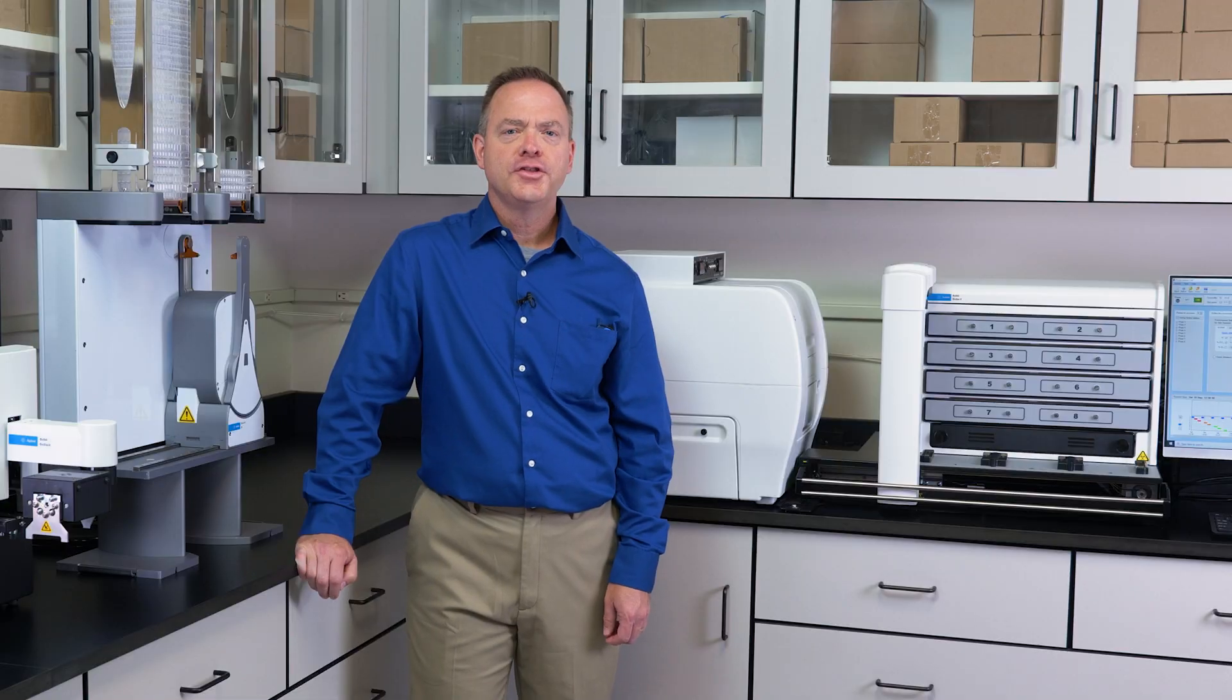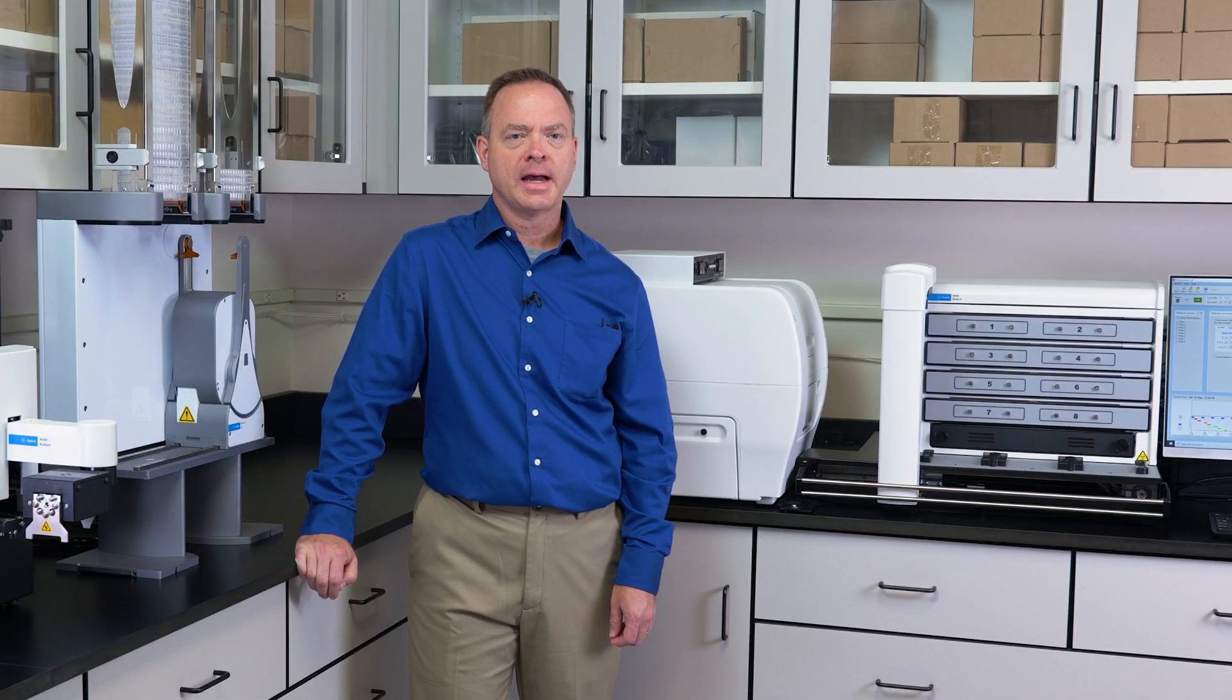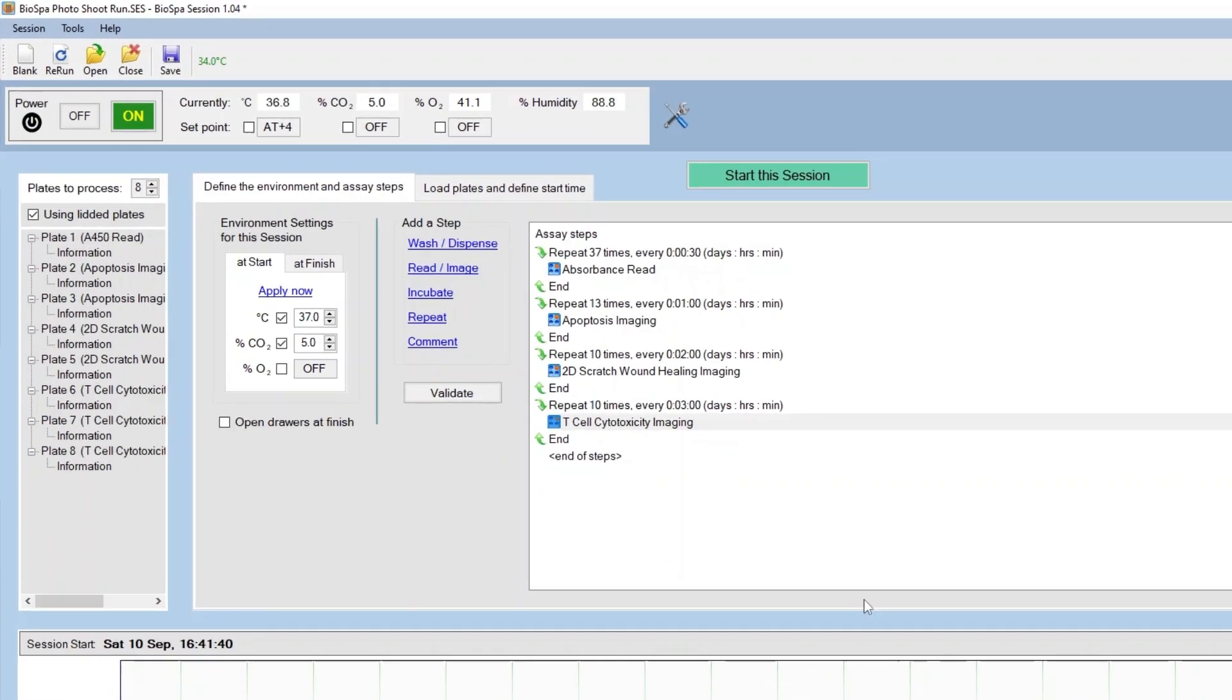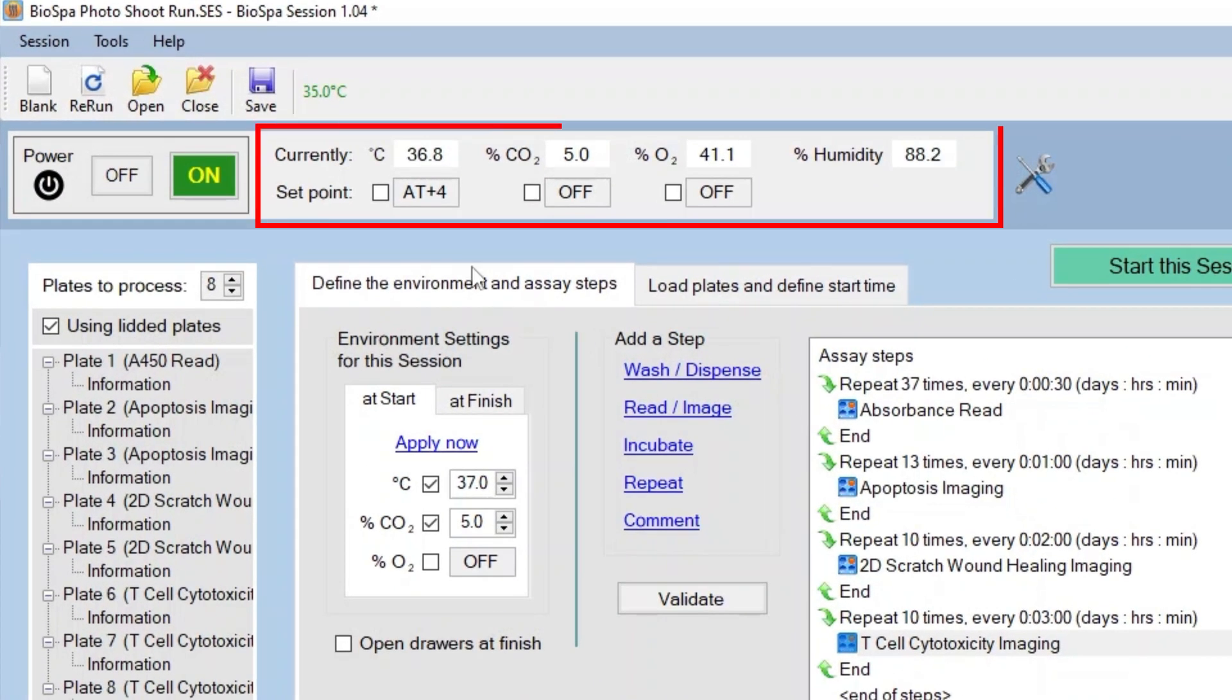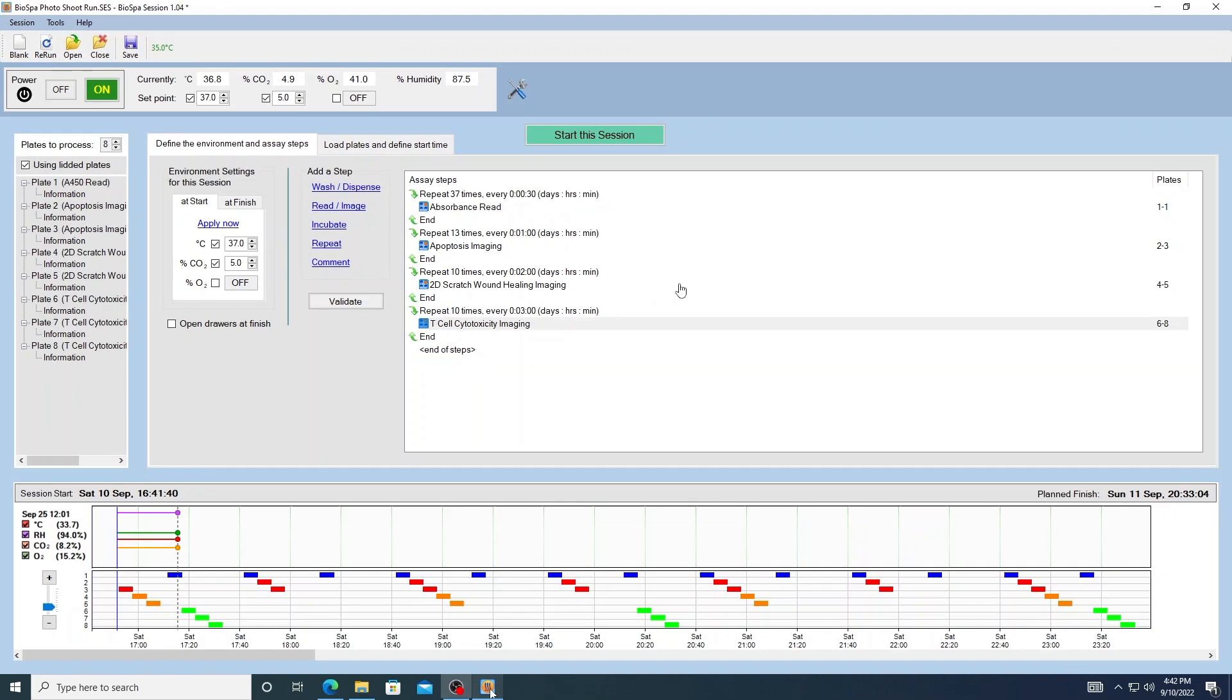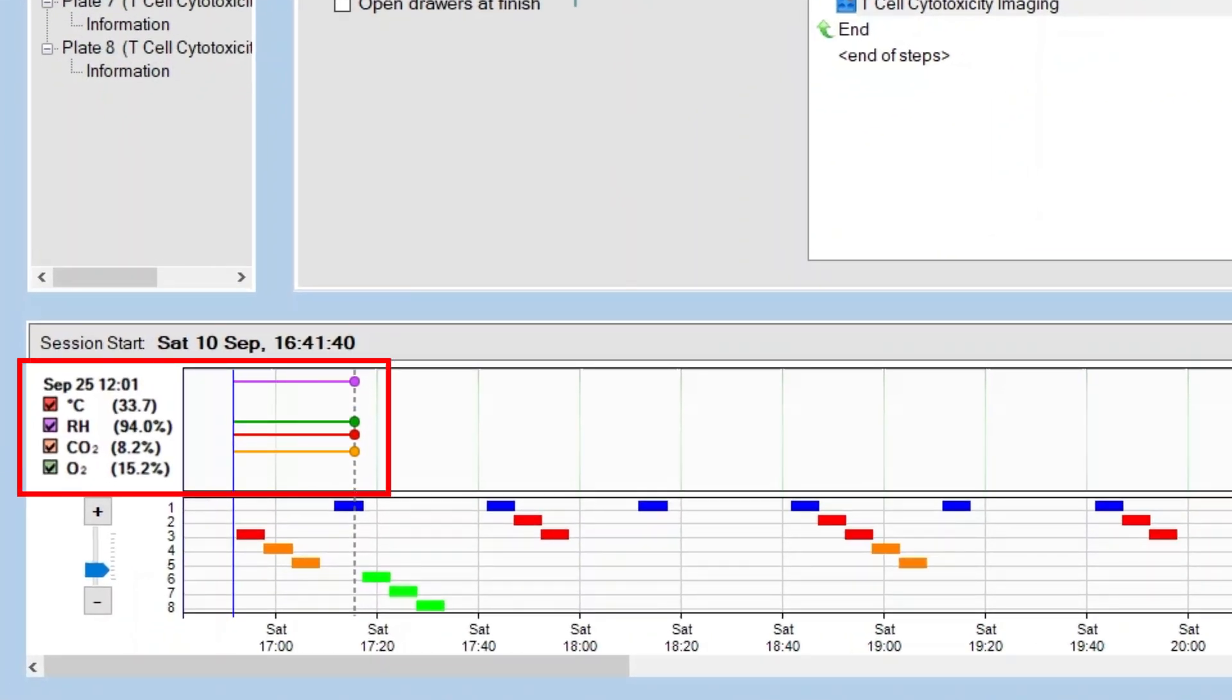The ability to perform kinetic live cell assay procedures is due to the environmental control capabilities within the incubator itself. The BioSpa has the ability to control temperature up to 45 degrees Celsius, allows sparging of carbon dioxide or nitrogen into the incubation chamber and contains a water pan to ensure proper humidity is maintained. Temperature and gas concentrations can be controlled by the user and all metrics are tracked and can be reported during the lifetime of the run.